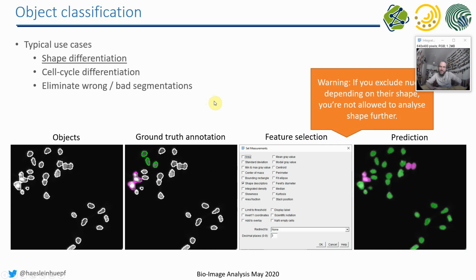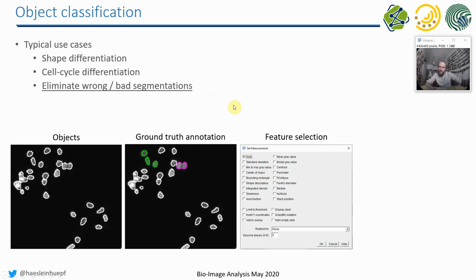There are some machine learning tools out there which do the feature selection for you, or where there is an automated default feature selection. And if you don't read this and then you do measurements afterwards, you may hit a wall which you don't see. So be a bit careful about feature selection.